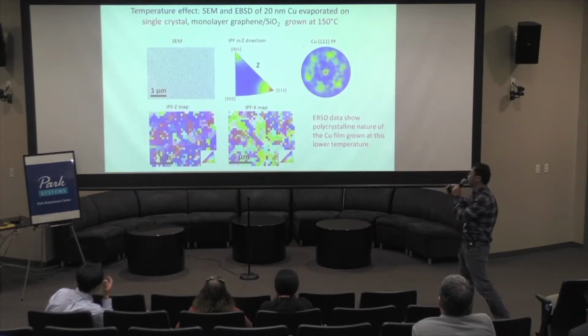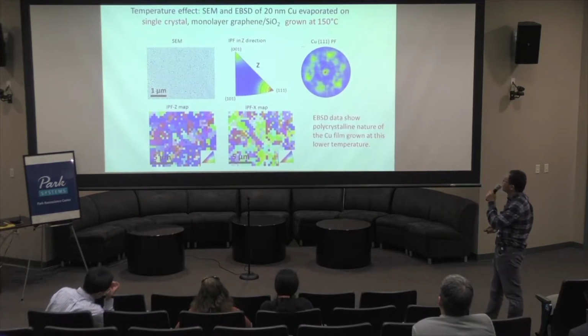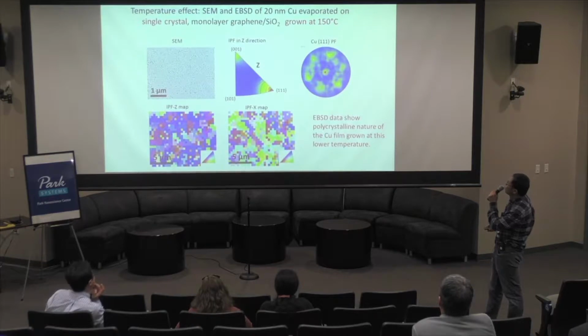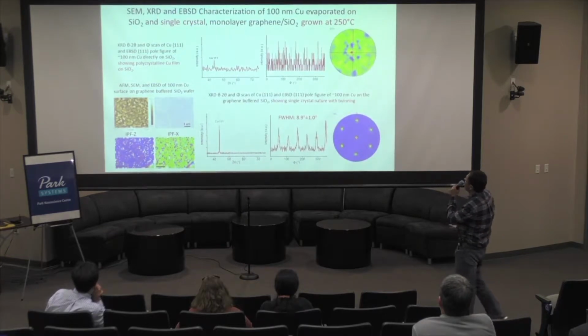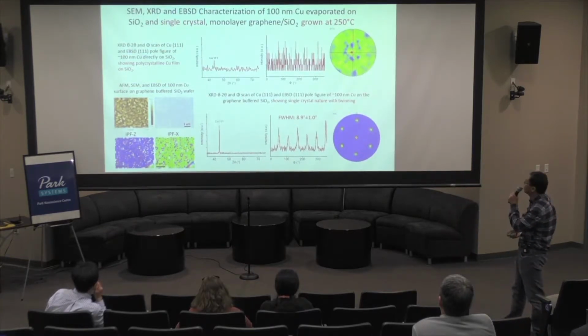So based on the EBSD data, we can see that the quality of the film at this temperature is not very good. So we increased the temperature to 250 degrees C.